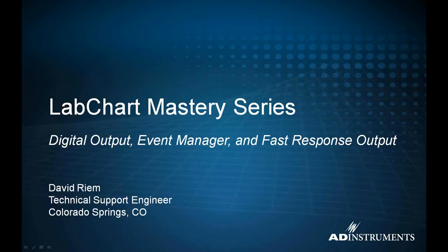Thank you again for attending one of our Lab Chart Mastery series. Today we're going to cover digital outputs and inputs, event manager, and fast response output. Two of these are extensions that can be added to Lab Chart, so they're free of charge, but they're additional plugins that you will need to download and install for your software. And digital output and input are actually pre-built in, I guess we could say, for Lab Chart.